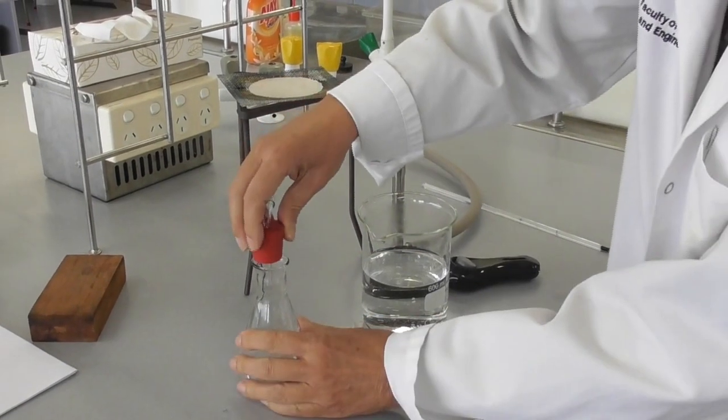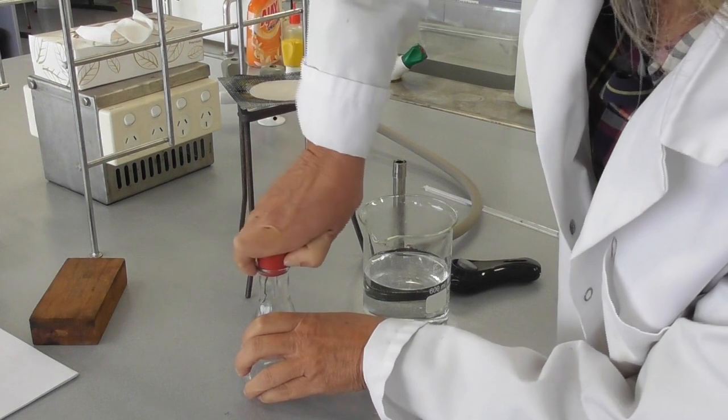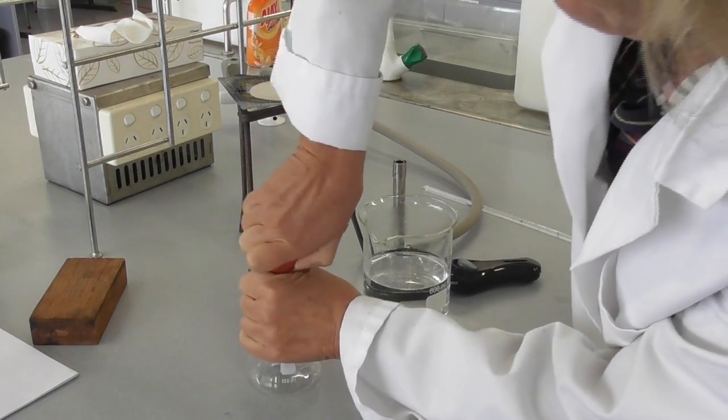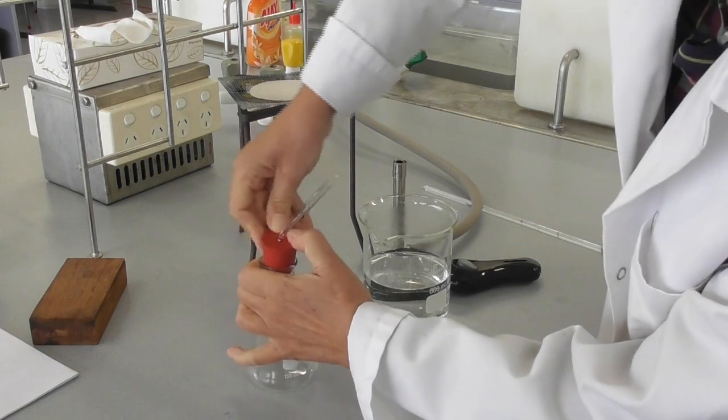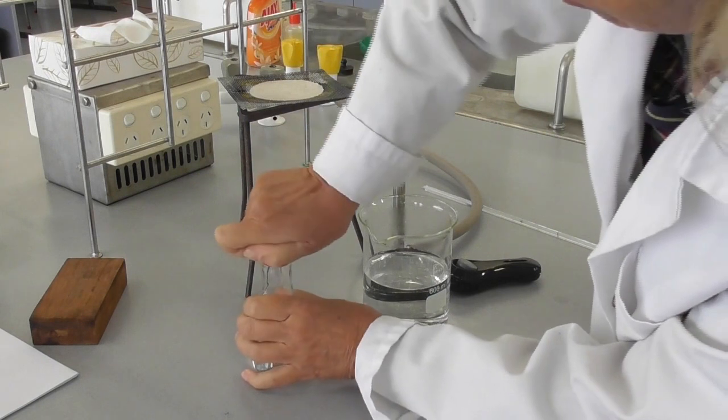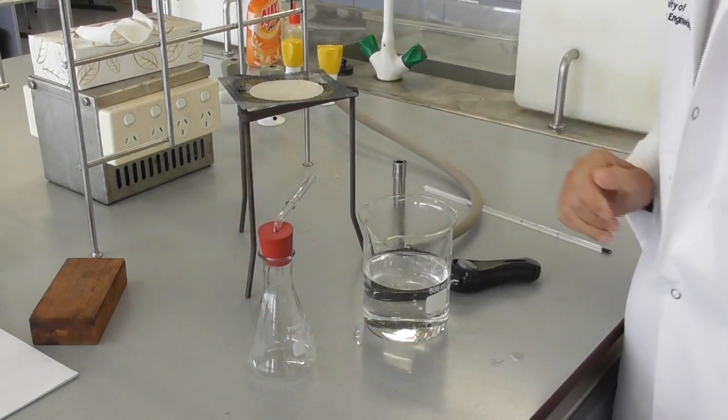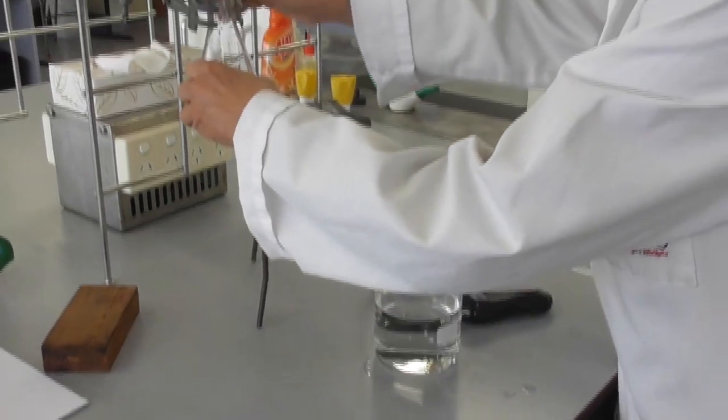We assemble the apparatus by putting a bung that has a hole in it into the neck of a 150 ml Erlenmeyer flask. The bung needs to sit tight and snug in the neck of the flask so it doesn't fall out later and there is no air flow possible.